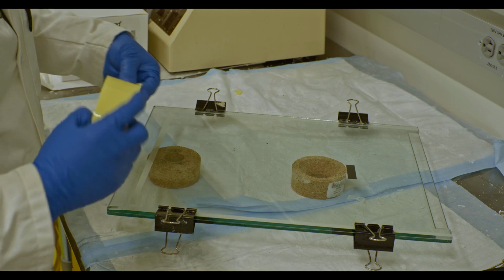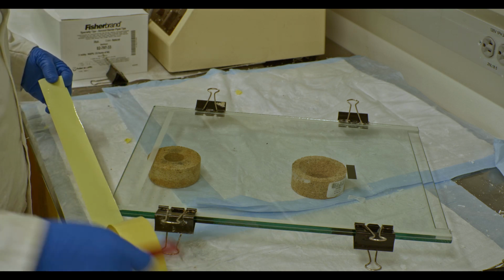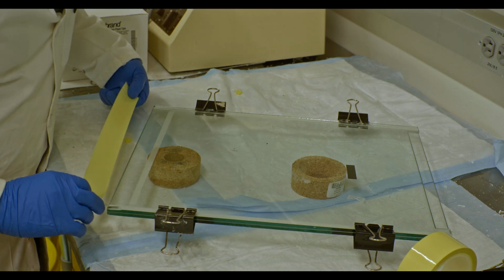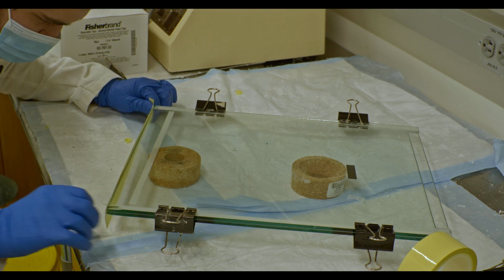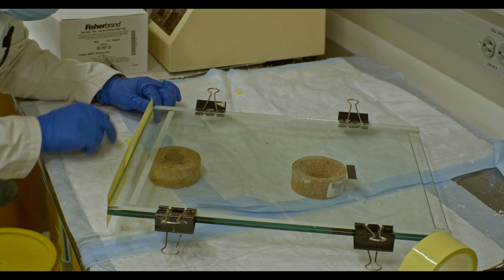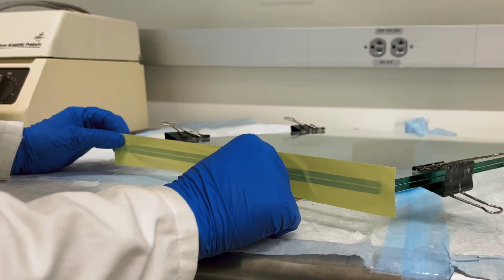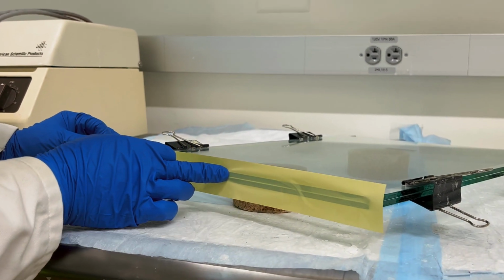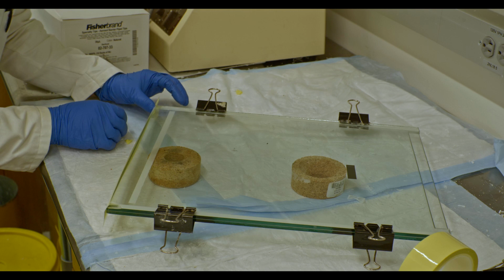So the best way that you can do is to kind of get a long piece of tape. It's a little bit longer than the bottom side. Right here. Get that piece of tape and do your best to even it out with the bottom. And then run your finger over the bottom to make sure that this tape has basically sealed here. And do you see these bubbles right here? So try to push those out. Make sure that this tape on the bottom is even. If you have to push out the tape a little bit and try to redo it, you can. This tape is actually quite easy to get off. As you can see, just like so.